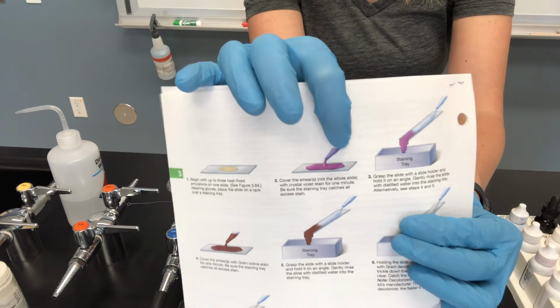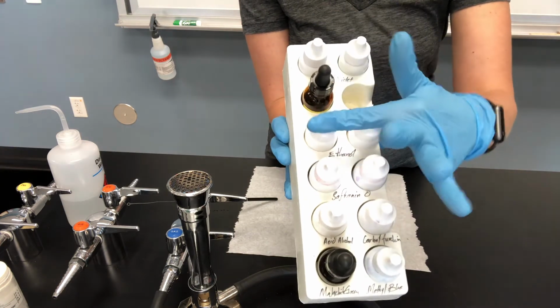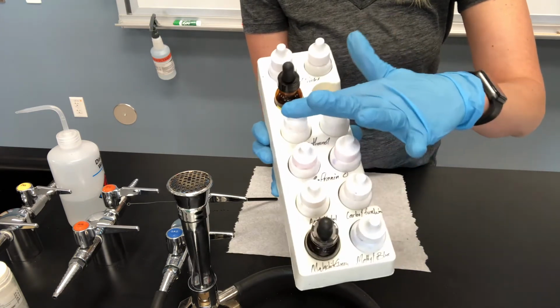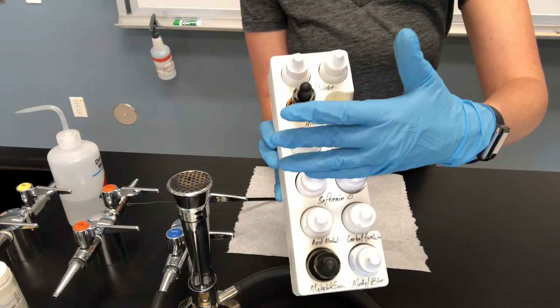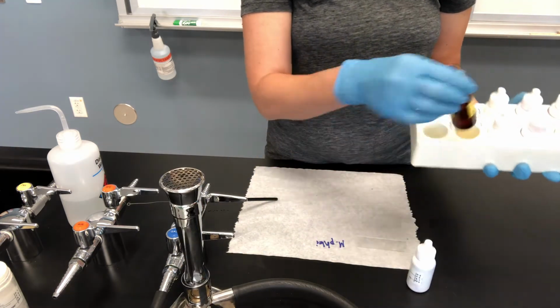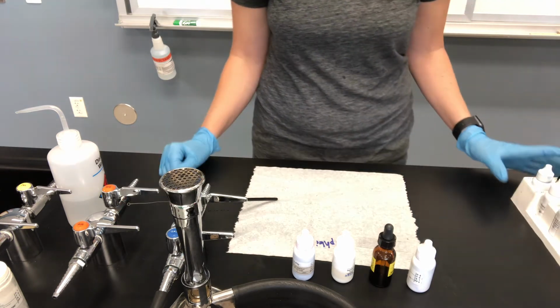So then we're going to do the first step of gram stain, which is crystal violet. Now in your stain boxes, the first four, there's two crystal violets, two gram iodines, two ethanols, and two safranins. So you have two sets of gram stain ingredients in each of these trays. What I like to do, because I want to be super organized, is set them all out in order right in front of me, and then your lab partner or the other people you share a table with can have the other set.